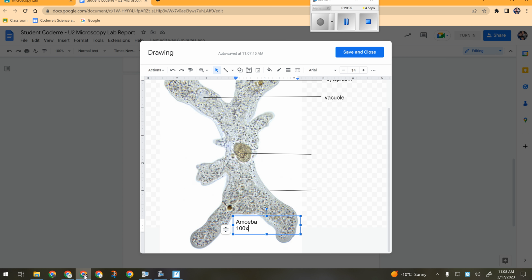Okay, as my other line, 800 micrometers. You can write UM for micrometers. It's actually the Greek letter mu, which is the Greek letter M, because you can't go MM because that already stands for millimeters. And a millimeter is 1,000 times bigger than a micrometer. So if you write in there that your amoeba is 800 millimeters, you are telling me that your amoeba is that big. I don't think so.